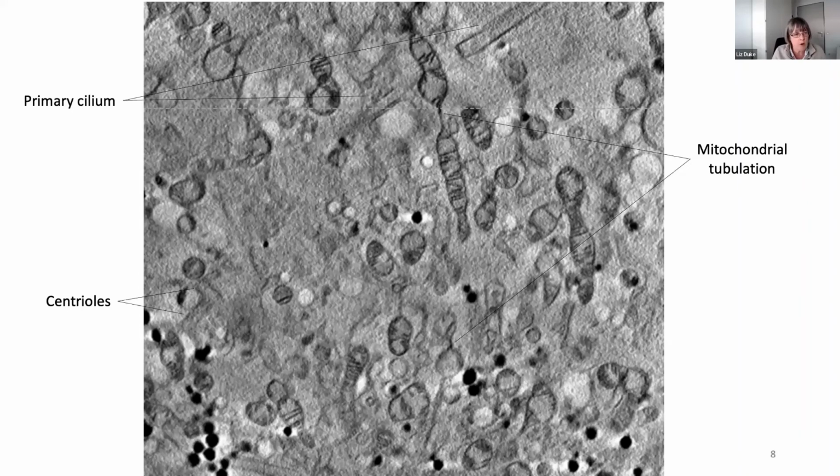And again, I would urge you to look at B24's website, where they show some absolutely stunning data, looking at virus entry in cells, and huge opportunities to study intact cells in their native state, where the only sample preparation that's been done is plunge freezing.